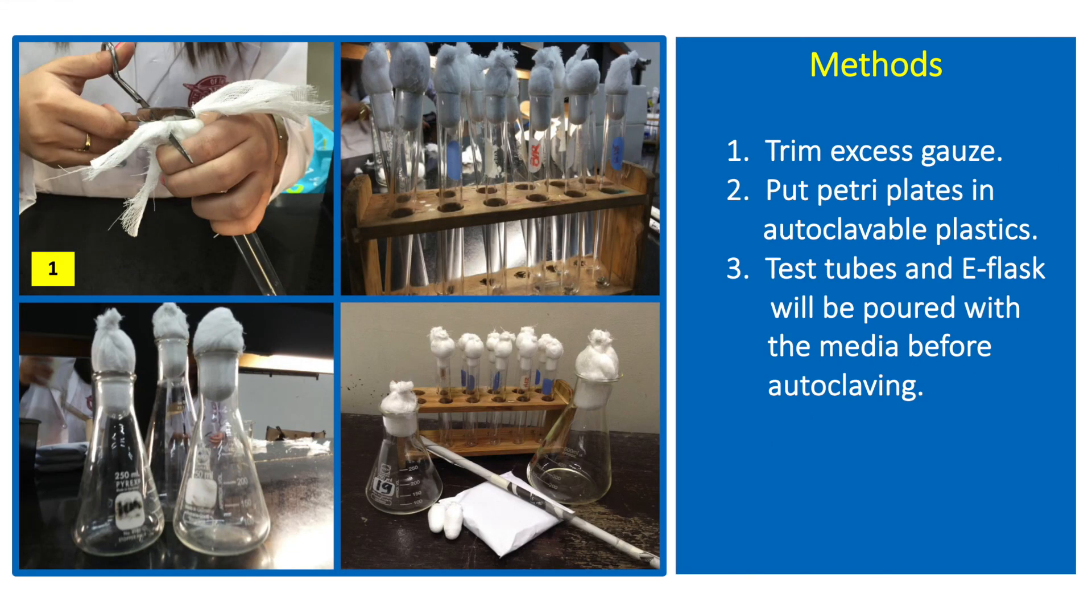After getting the proper fit, tie and cut the excess gauze from the plug. Additionally, aluminum foil can also be used to cover the cotton plugs before putting in the autoclave.